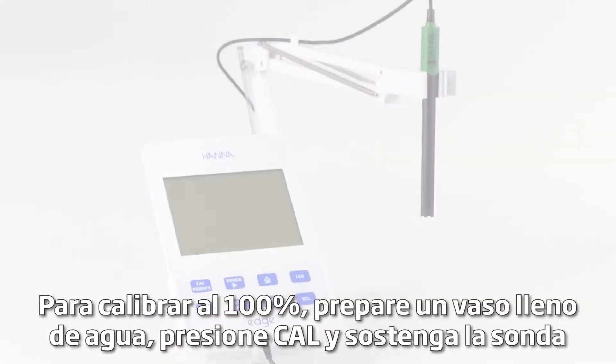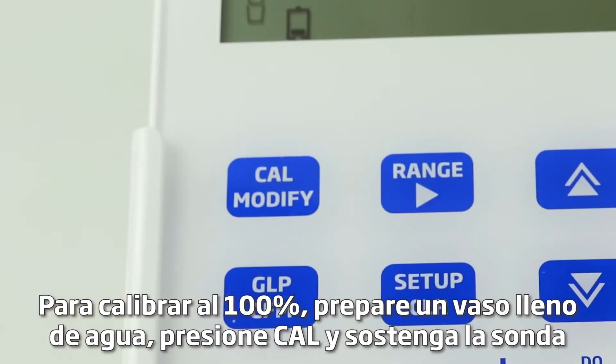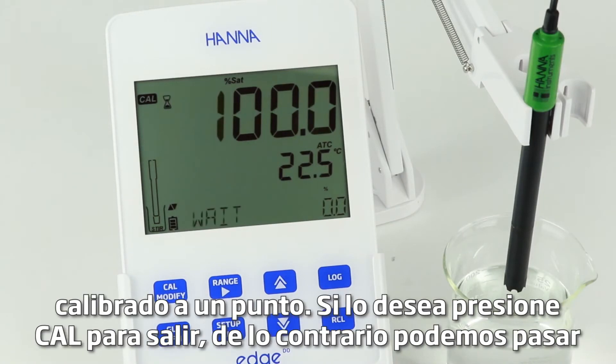To calibrate at 100%, prepare a beaker filled with water. Press Cal and hold the probe just over the beaker with water — make sure you don't submerge the probe. Once the reading is stable, press confirm to accept the calibration point. Edge is now calibrated to 1 point.